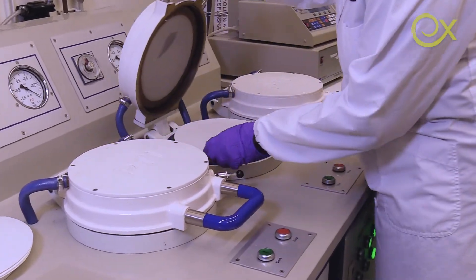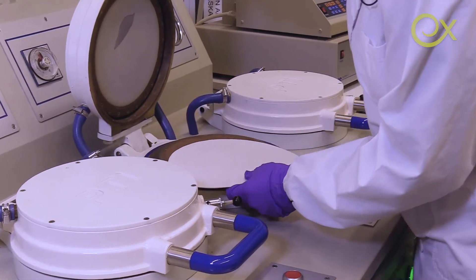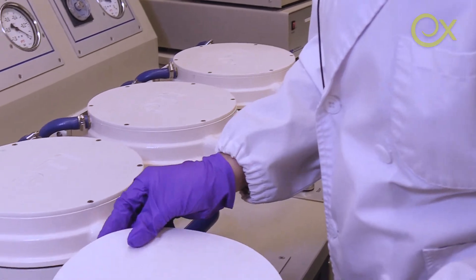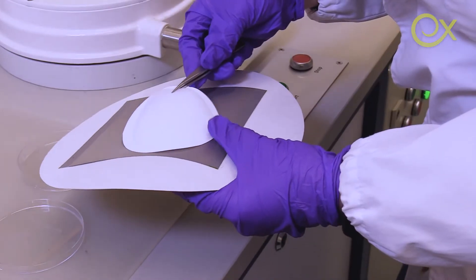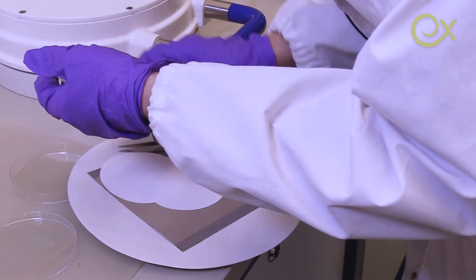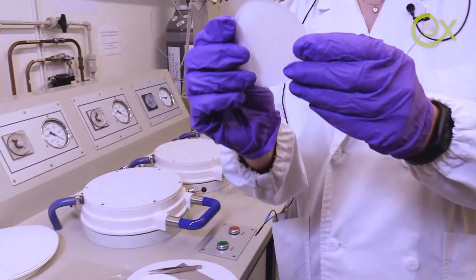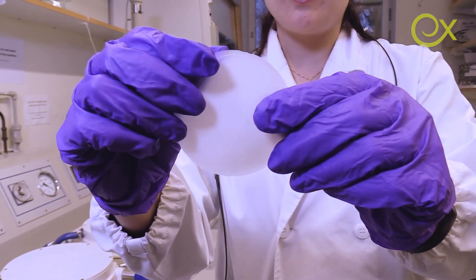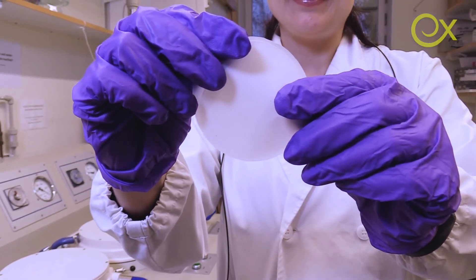I open the rapid Köthen sheet former — let's see what we have. Here is the paper. You see, it's almost transparent.